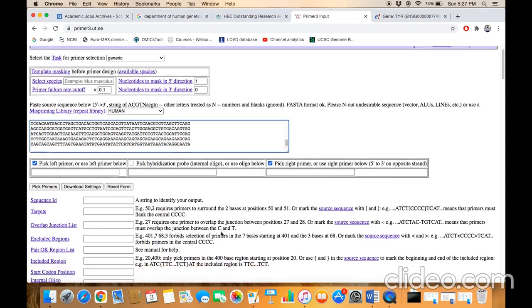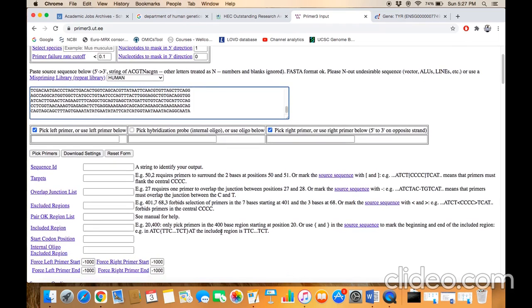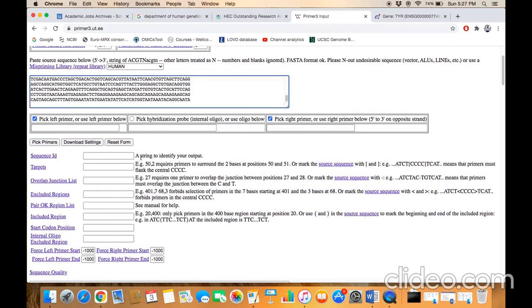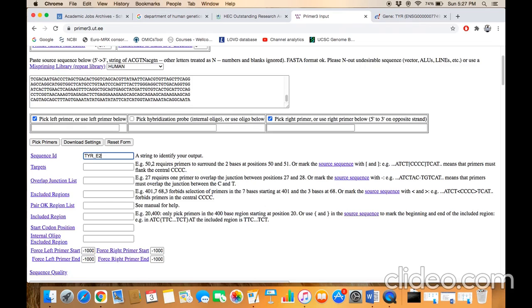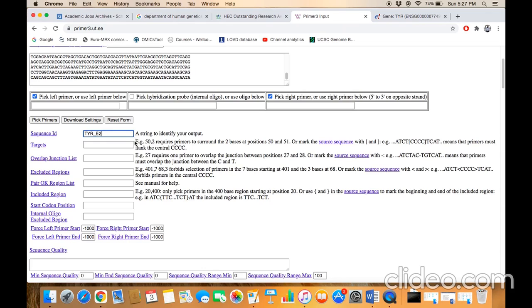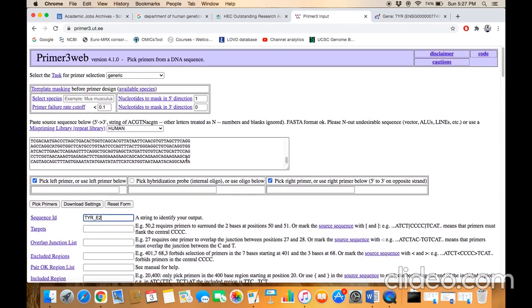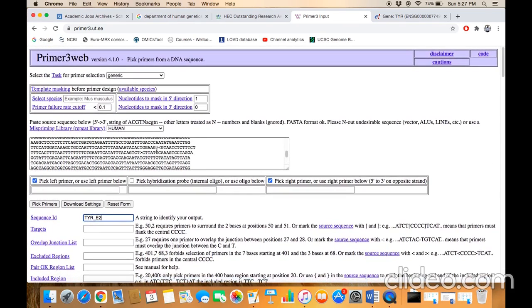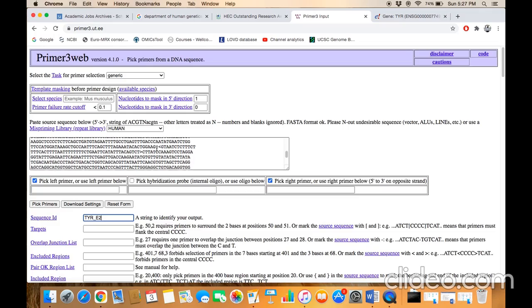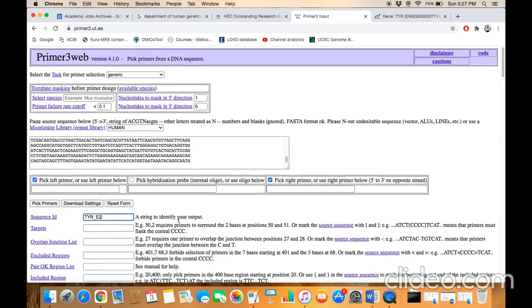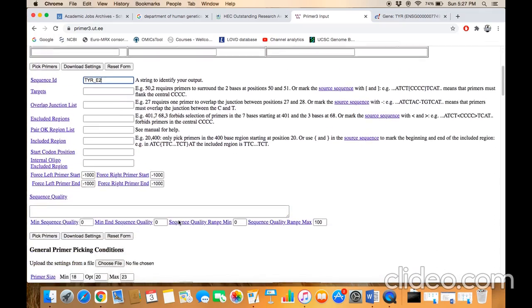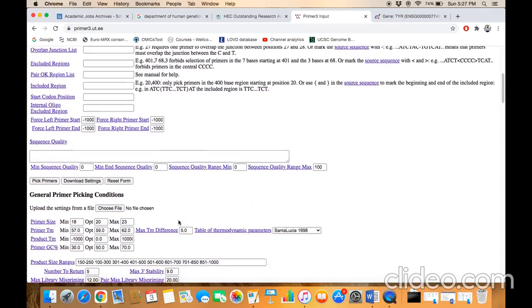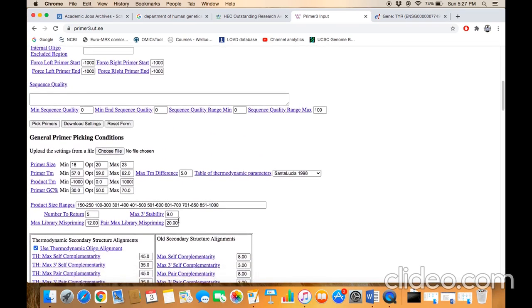going to design the primer set for exon number 2. Leave all these options at default because we've already defined these features like the target region and excluded region. Just scroll down the page.